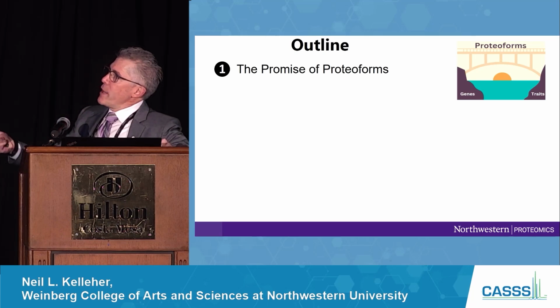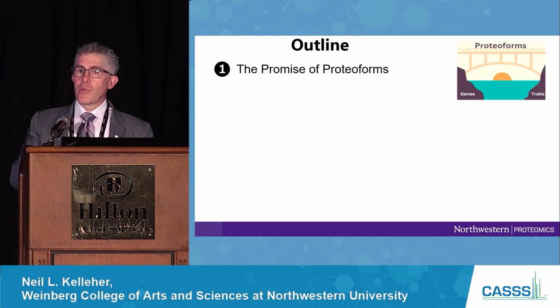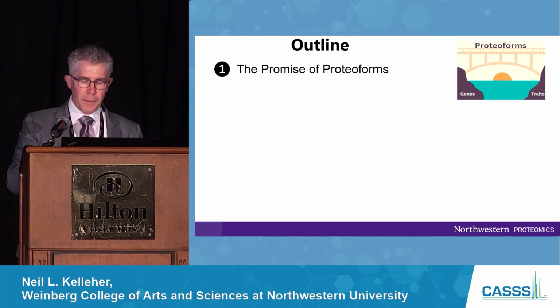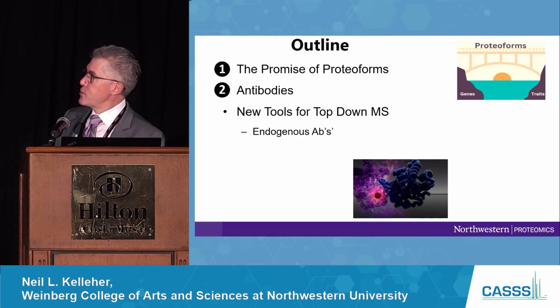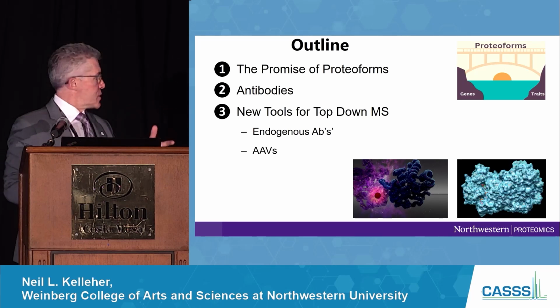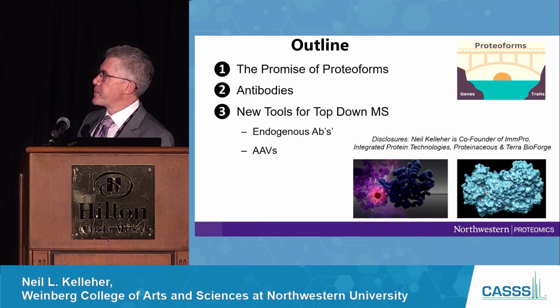And so I'm basically the pitch person for the value of assigning protein structure and composition with complete molecular specificity. So that's primary structure. And so, of course, for this crowd, we're doing antibodies. I'm going to tell you about some new tools, including that's used on endogenous antibodies. And I'll use the very same methods, and I'm sure some of you have heard about the charge detection technologies that have really grown up during the pandemic and in the days after.